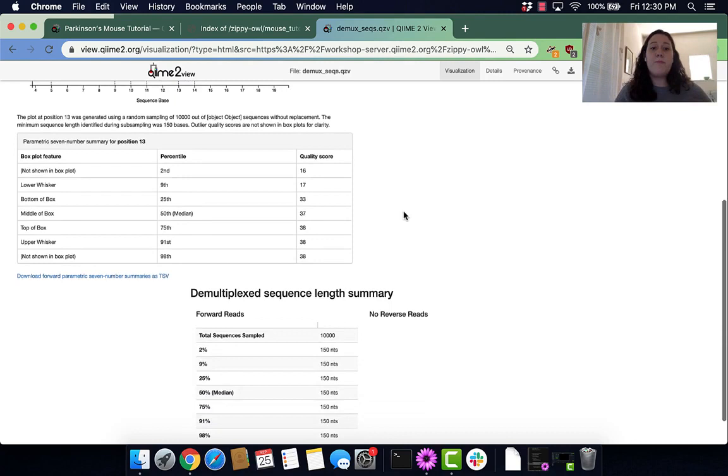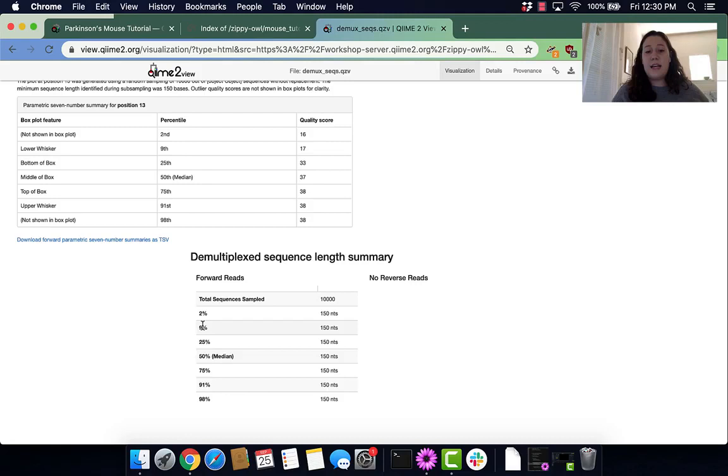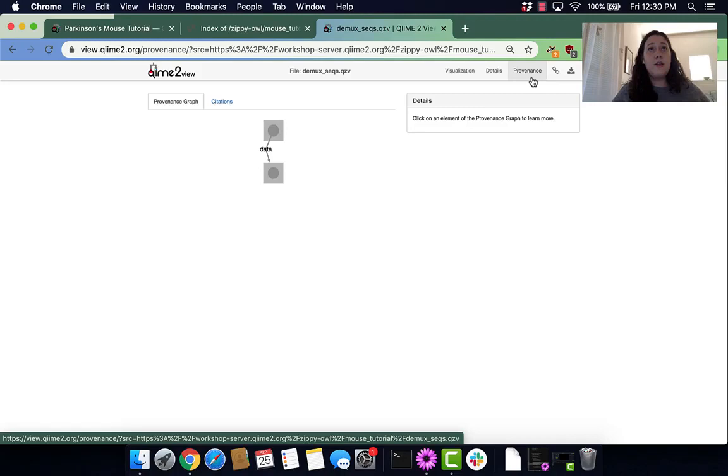A little bit further down, we can see the sequence length summary, which just says how many nucleotides are in each sequence, which is 150.